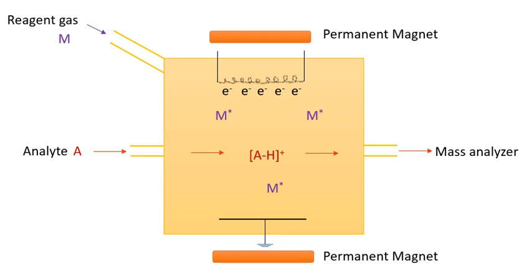Topic: Applications. CI mass spectrometry is a useful tool in structure elucidation of organic compounds. This is possible with CI, because formation of MH+ eliminates a stable molecule, which can be used to guess the functional groups present. Besides that, CI facilitates the ability to detect the molecular ion peak, due to less extensive fragmentation.